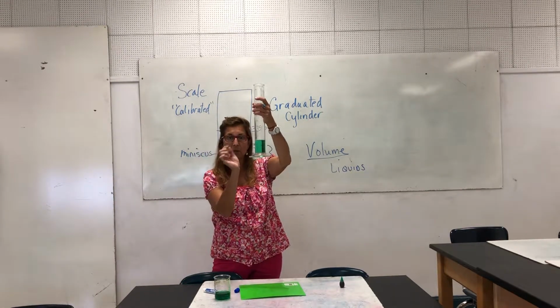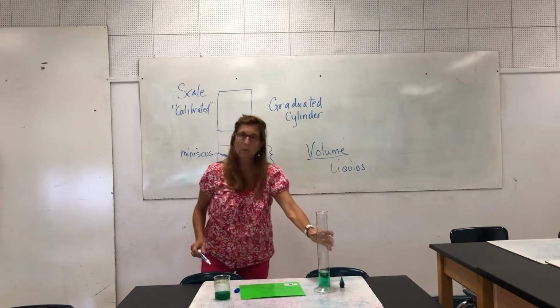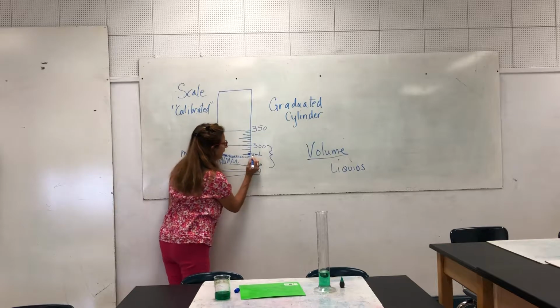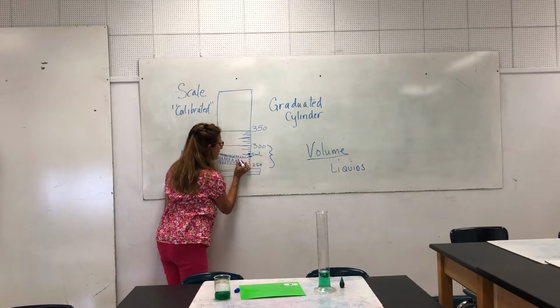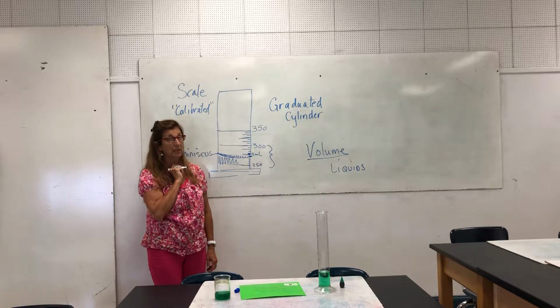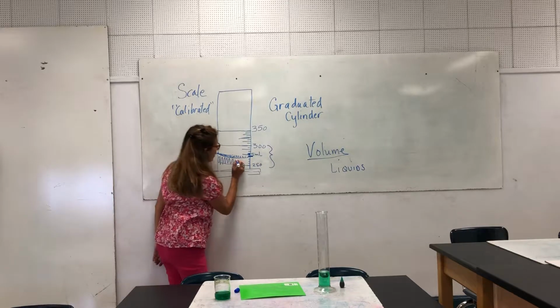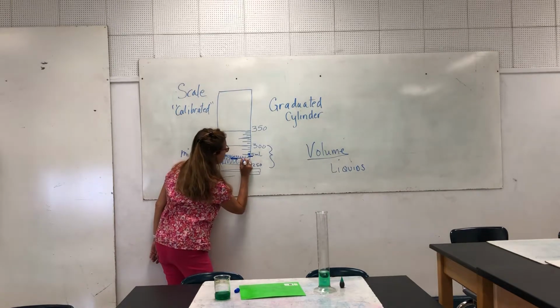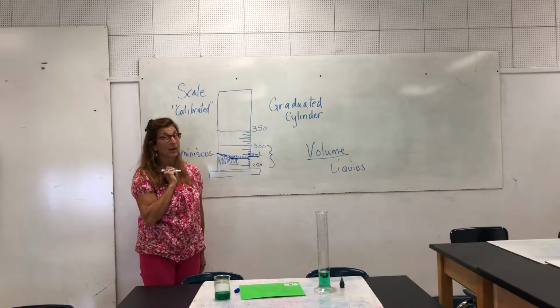Sometimes the smaller the cylinder, the greater the appearance of the meniscus that you will have. So, here's the question. When I read the cylinder that's full of fluid, and the side of the fluid is here, but I can see that the meniscus goes like that, how much fluid is actually in the cylinder? Is it where the water is on the side, or is it where the water is at the base of the meniscus? Which in this particular case would go to this line. The top of the cylinder goes to this line. So which one is the correct one?